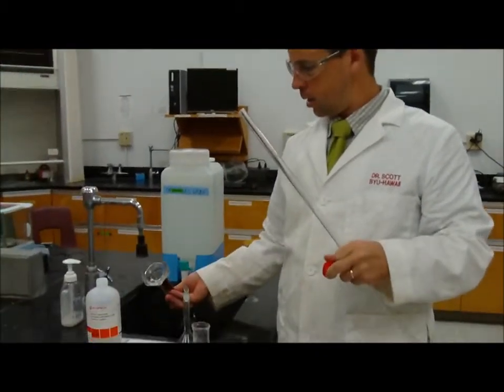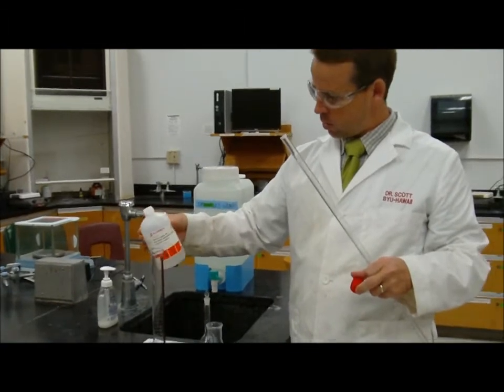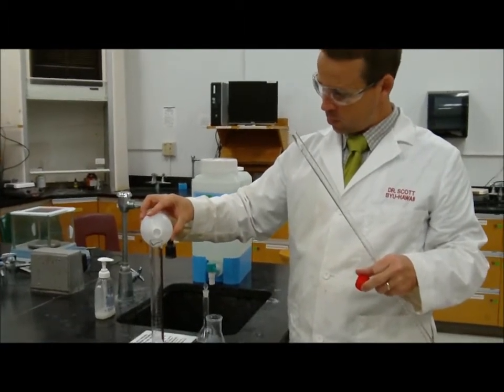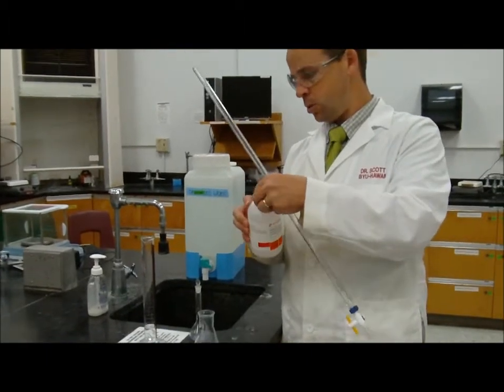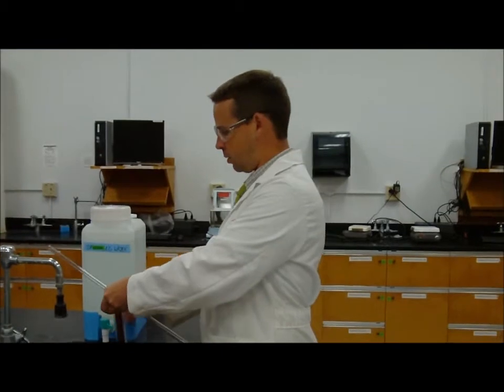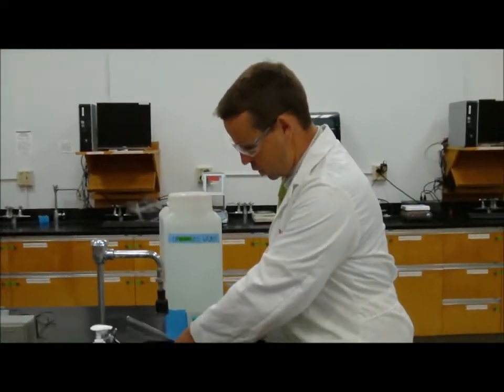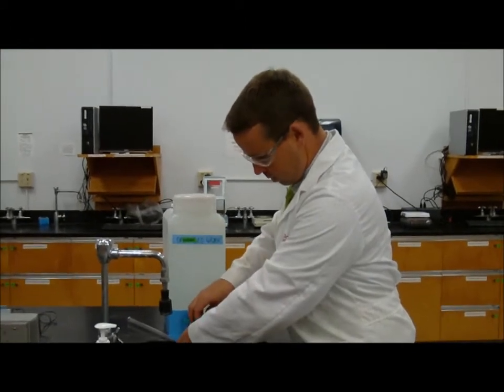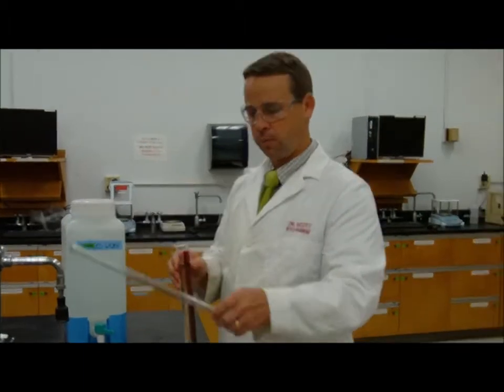I'm going to make a solution of sodium hydroxide here. This is 0.5 molar, so I'm going to use 20 milliliters of this and dilute it up to 100 milliliters. Again, I'm using a graduated cylinder, so I'm not very precise. I'm just performing a titration to give you a general example of how titrations are supposed to be performed, the kinds of things you want to be aware of, right?